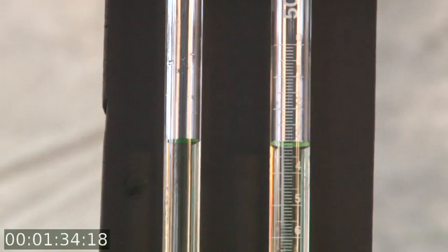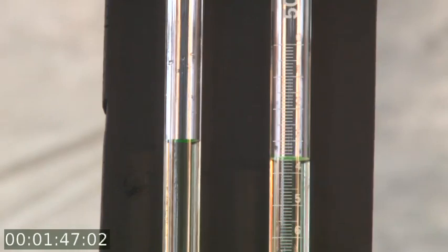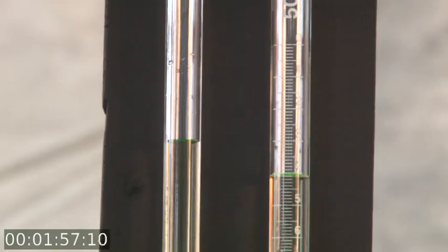So that's your first reading that you've just made. This is now going to continue. I'm going to leave you to take another four readings over the next 5 minutes or so. Make sure that when you take the reading, the levels are equal, and get a reading on the clock of the time and a measure of the amount of gas evolved. When you've done that, I will rejoin you and we can discuss how to treat the data.